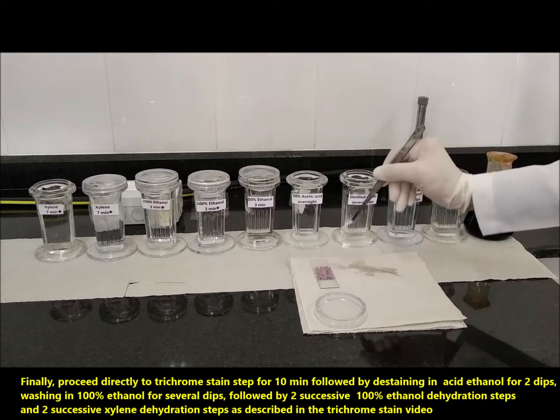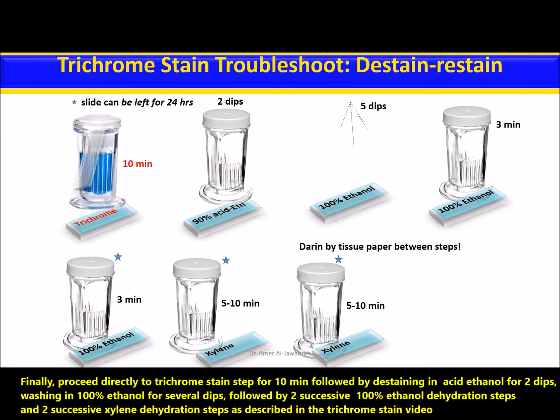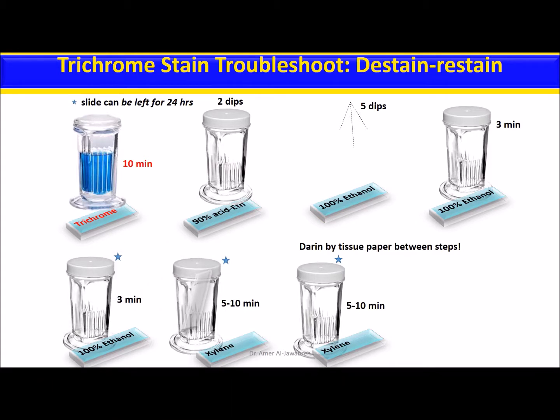Finally, proceed directly to the trichrome stain step for 10 minutes, followed by de-staining in acid ethanol for two dips, washing in 100% ethanol for several dips, followed by two successive 100% ethanol dehydration steps, and two successive xylene dehydration steps as described in the trichrome stain video.